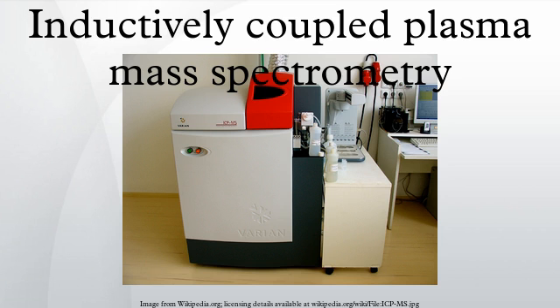The collisional reaction interface technology used in the Bruker ICP-MS is another effective approach to removing interfering ions. It is essentially a mini collision cell installed in front of the parabolic ion mirror optics. The proprietary collisional reaction interface removes interfering ions by injecting a collisional gas, or a reactive gas, or a mixture of the two, directly into the plasma as it flows through the skimmer cone and/or the sampler cone.